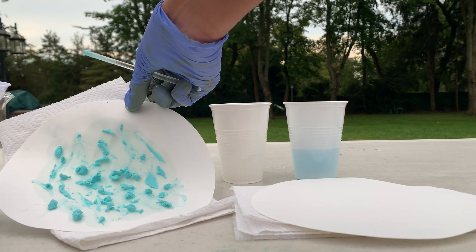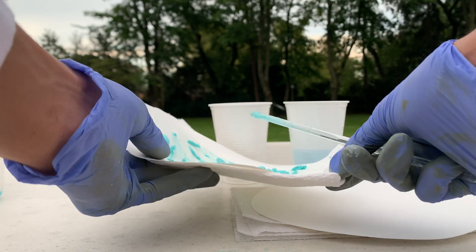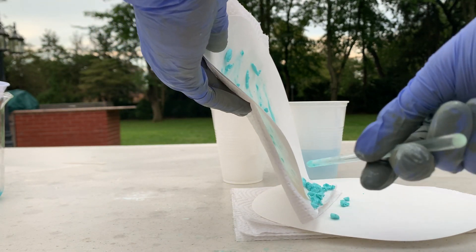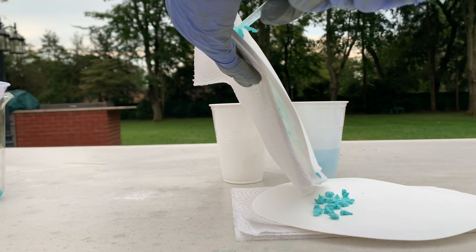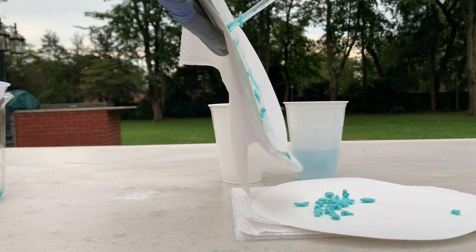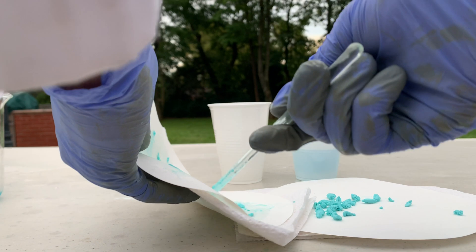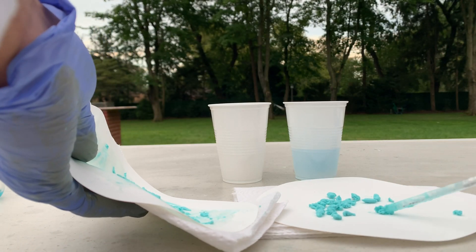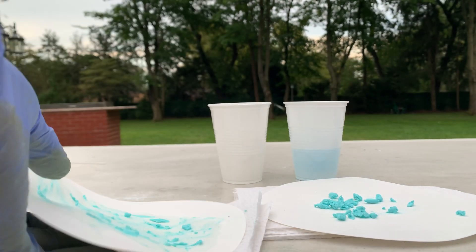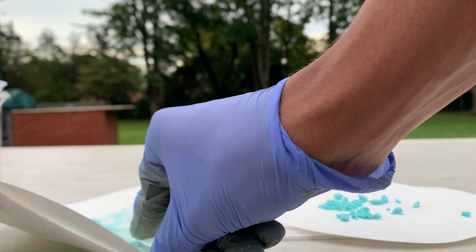Let me give you a quick look at the copper carbonate. I'm going to put this all onto the other filter paper. You can really see why this is used for paint — the texture is very soft and it has a beautiful color as well. I don't want to waste any of this so let's scrape it all off.